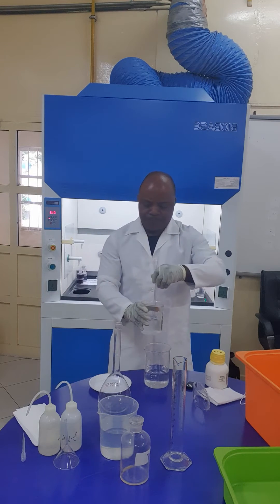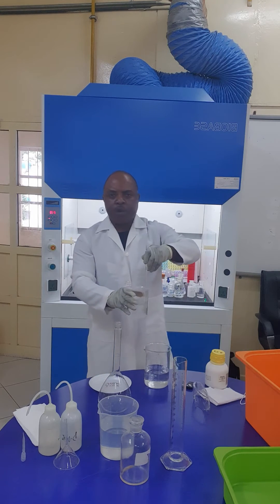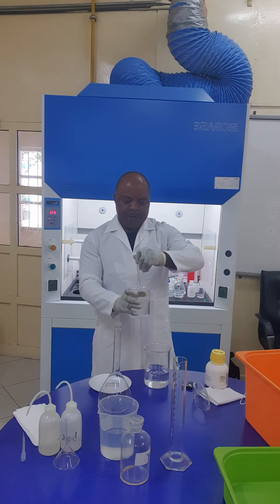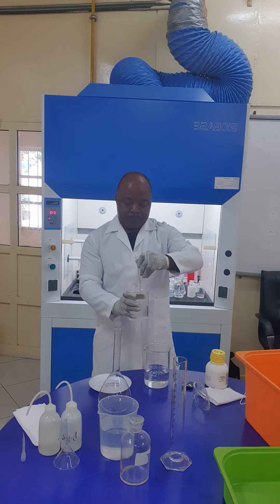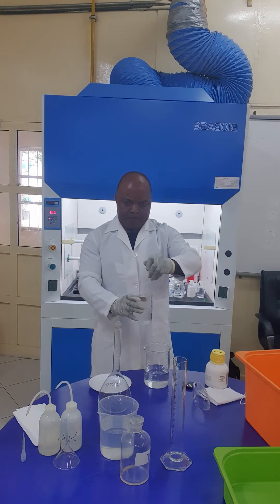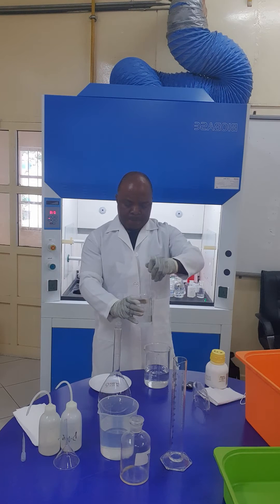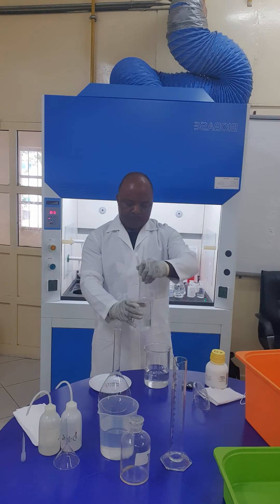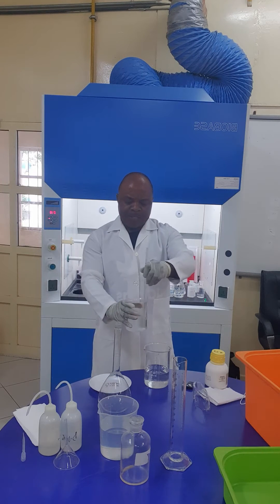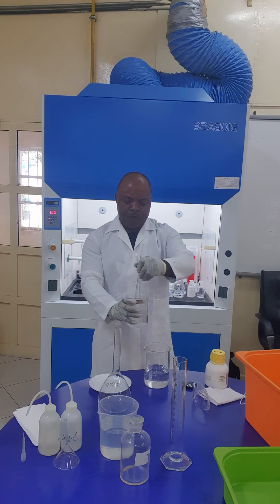Keep on stirring it using the glass rod. Stir it continuously using the glass rod. Note that the reaction is exothermic because there is evolution of heat.